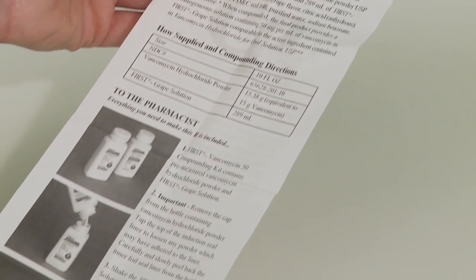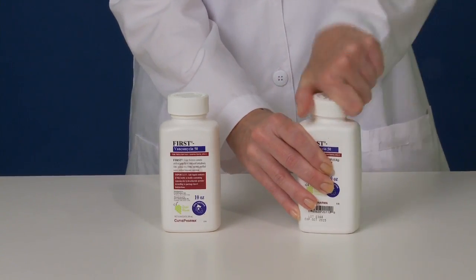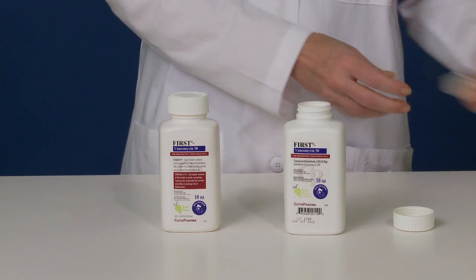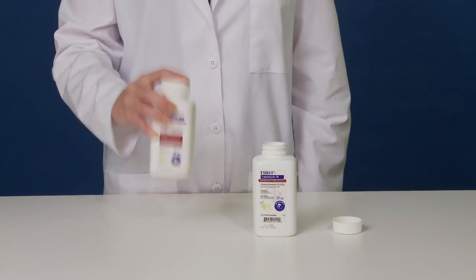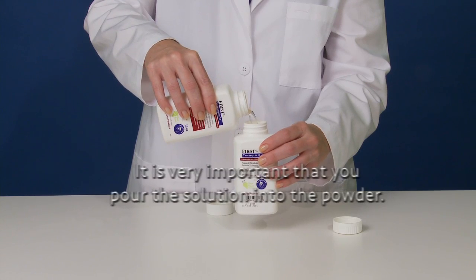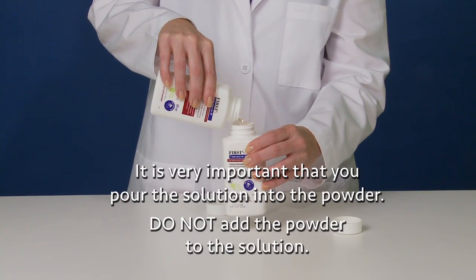To compound FIRST vancomycin, the first step is to prepare the powder. Uncap the bottle and tap the induction seal liner to loosen any powder which may have adhered to it. Now carefully peel back the liner to remove it. Discard the liner and set the powder bottle aside. Next, shake the solution bottle for a few seconds. Open it and pour all of the solution into the powder bottle. It is very important that you pour the solution into the powder.